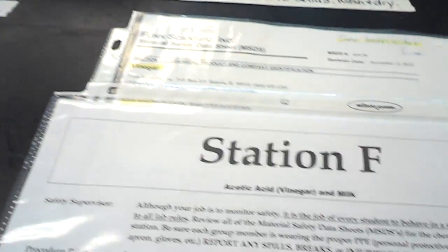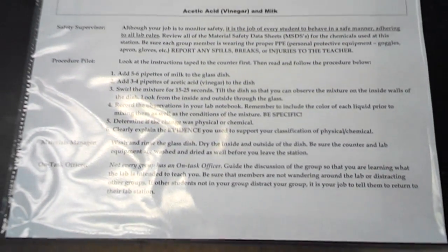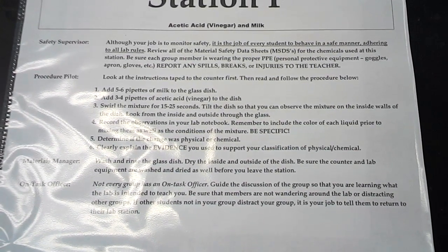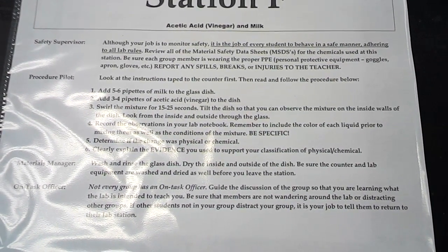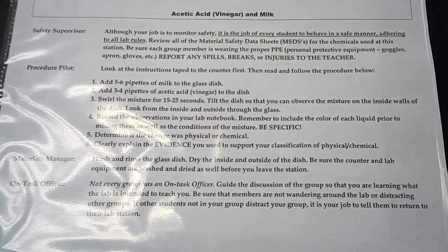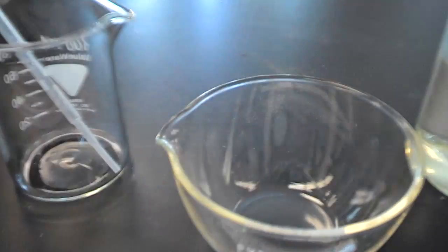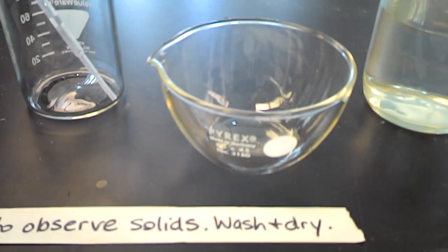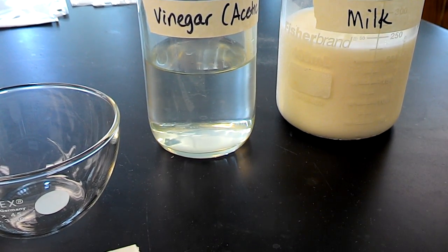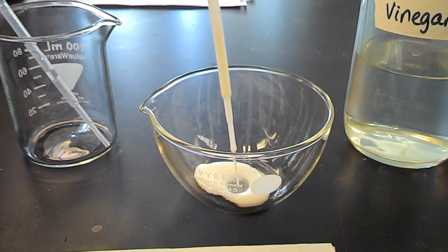Let's go to Station F. Station F is acetic acid or vinegar added to milk. Your safety supervisor will tell you that you do need to wear PPE here because you are using an acid. So it tells you to take 5 or 6 pipettes of milk. And so we're going to add the pipettes of milk to the dish.